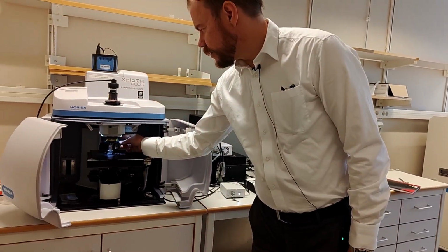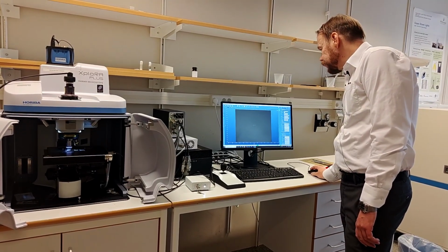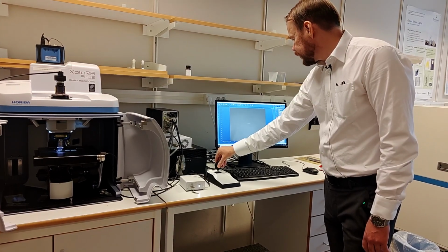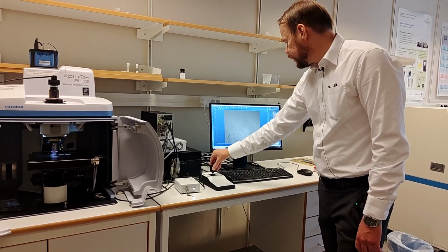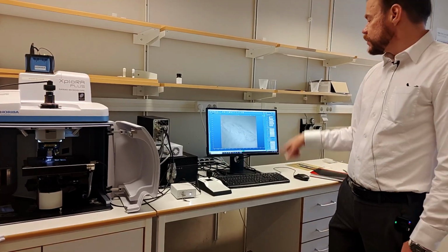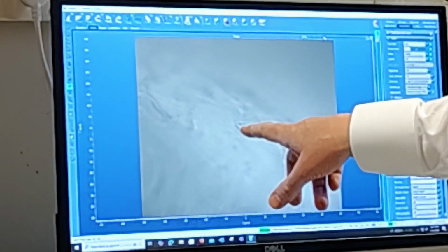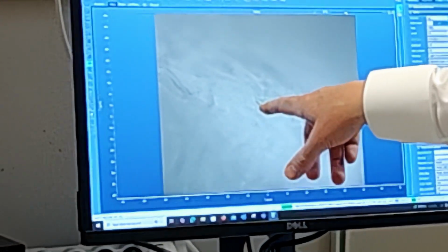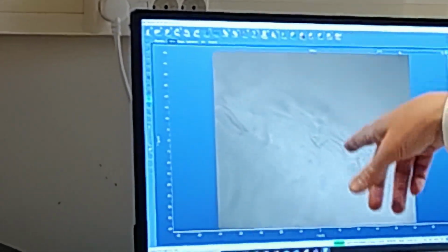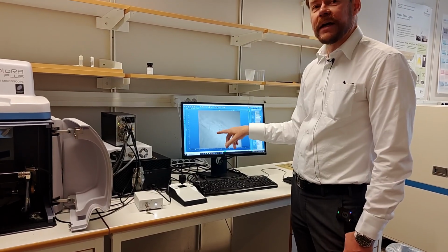I rotate in the 100 objective. Let's increase the light a little bit. And we try counterclockwise. Here you see it comes. It's in focus there now, right? So the laser, that green little dot, is about 1 micrometer in size. So that dot is quite representative of the laser beam spot size. That is where the area of information will come from.